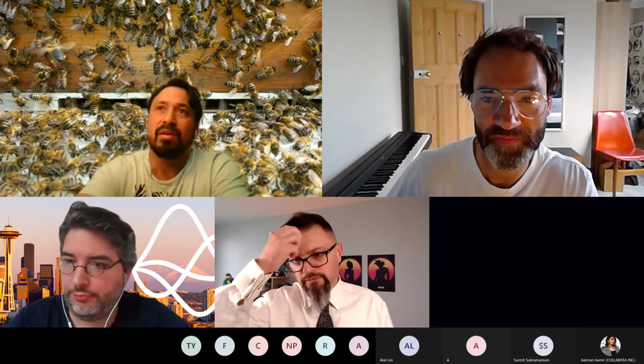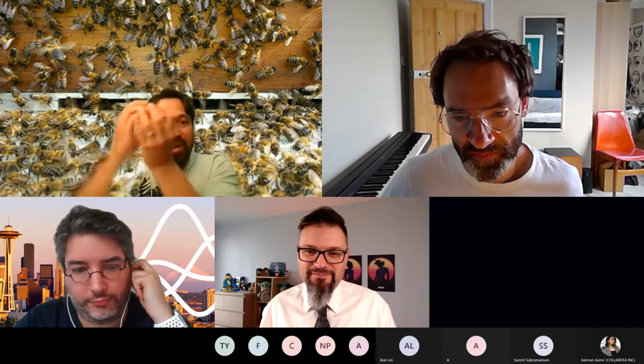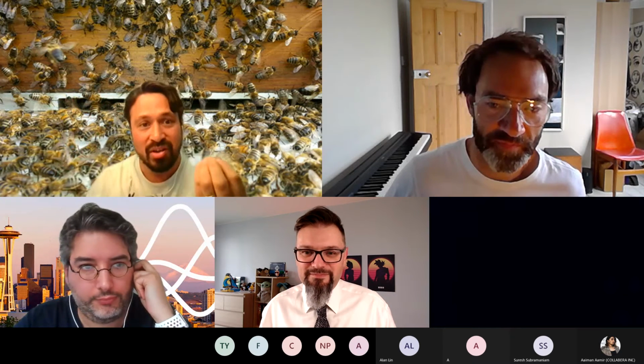Do you want to add something, Kim, about the complexity of the counting and identification of the pollen? Yeah, it's true that for the counting, the preparation is very important, because when the bees come back with the pollen, it's not just one grain, it's a pellet of pollen. That means you have a lot of pollen in a small pellet.